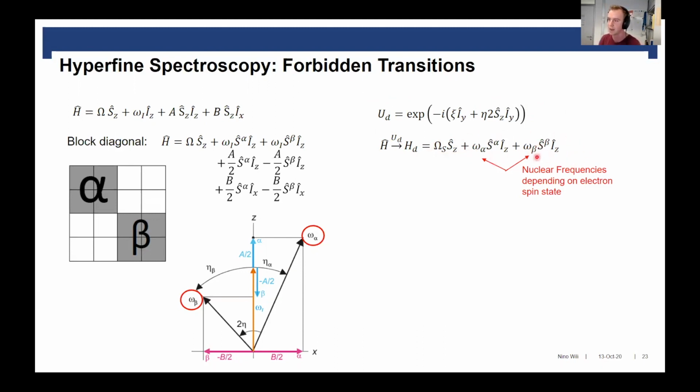And here it's diagonal. But then you also have to put your excitation operators into the same frame. If you use S_X, you transform it to the eigenbasis, or the diagonal basis, of your Hamiltonian. You see that with a certain probability, you actually excite electron-nuclear transitions.